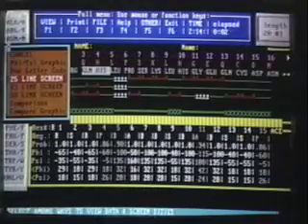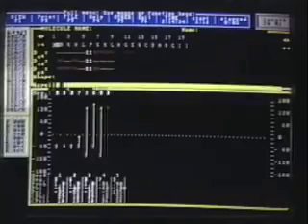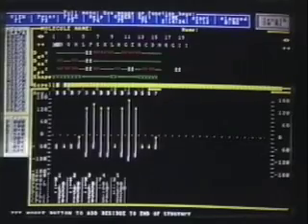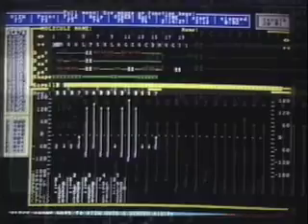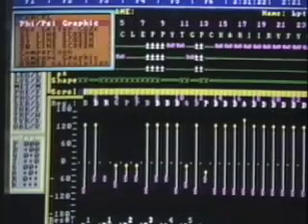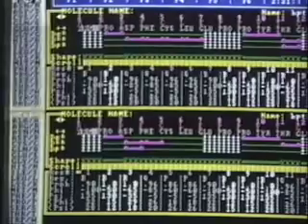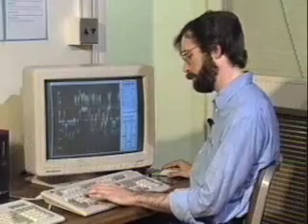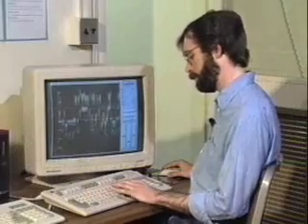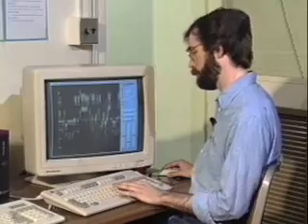The results — that is, the Phi-Psi values — along with their corresponding probabilities and standard deviations, may be displayed graphically or in a tabular form. The program may also be used to compare the backbone conformations of two structures. The example shown here compares the backbone conformation of bovine pancreatic trypsin inhibitor derived from NMR data with that observed by X-ray.